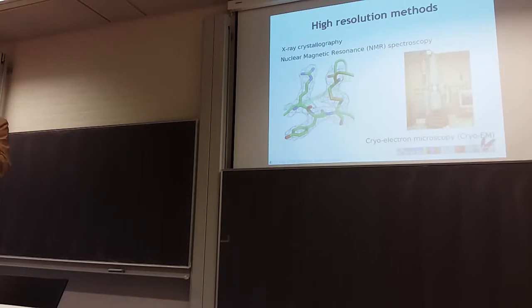There's a very cool figure in the book that I haven't had time to put in the lecture yet, which does that for a membrane complex in a bacterium, imaged as it's infecting a human cell in culture. You find about 1,000 of those complexes in your images, and you combine those, and then you can get to resolutions of 5 to 8 angstroms. That's really cool.